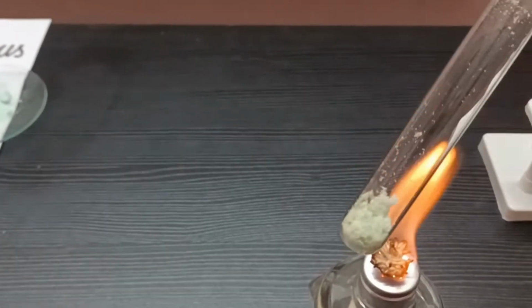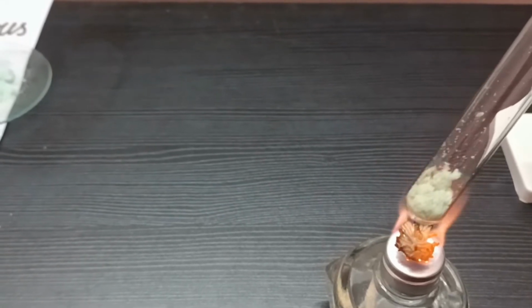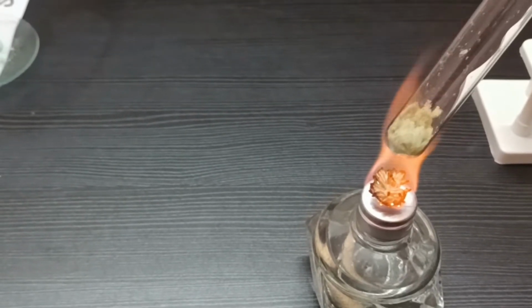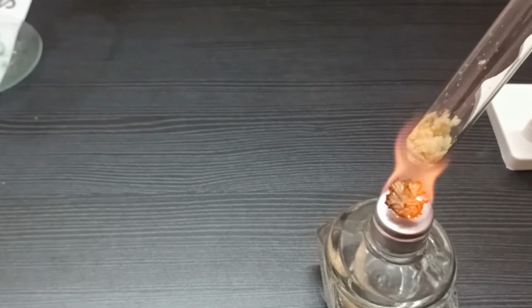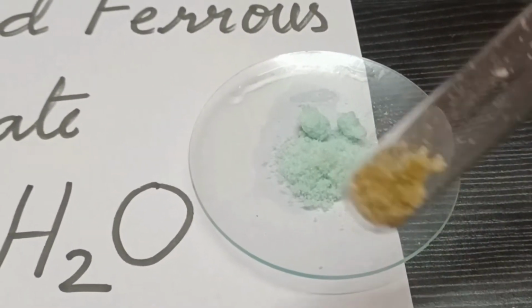Now we can start heating the ferrous sulphate crystals. As you know, decomposition reaction of ferrous sulphate is an endothermic reaction. So we need to supply heat energy. Here we have taken a spirit lamp to heat the ferrous sulphate crystals. Notice the color changes of ferrous sulphate crystals. Compare it with the color of hydrated ferrous sulphate crystals.